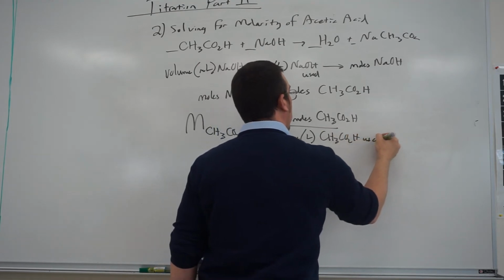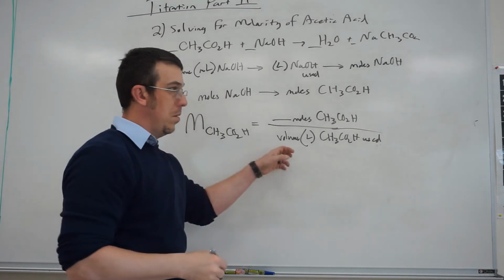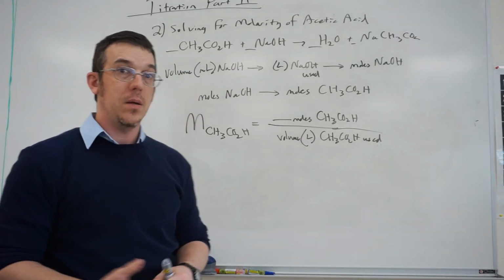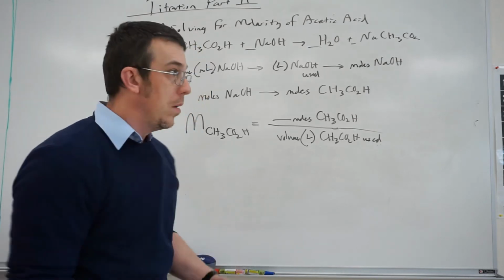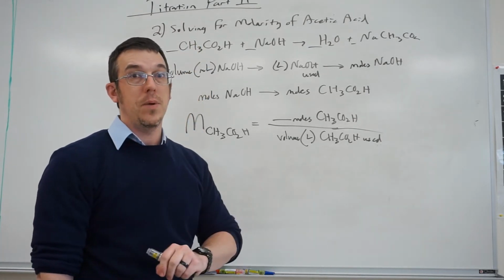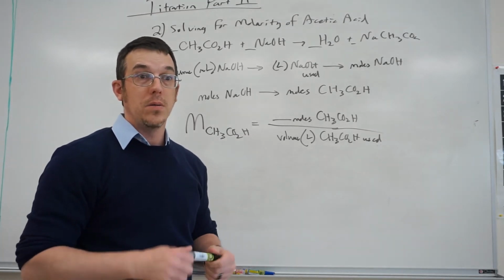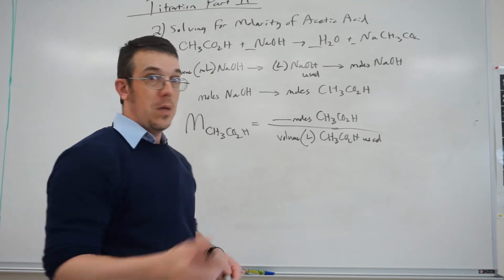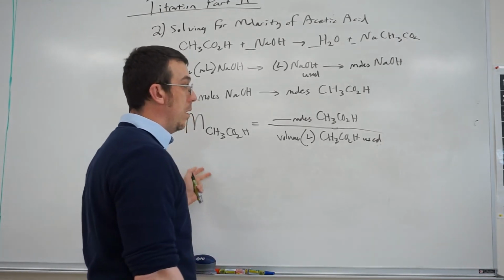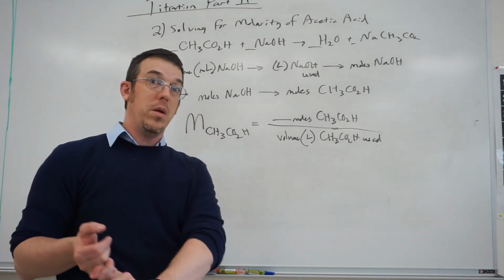used. Again, this will be provided to you on Moodle in a picture. So all your data that you're going to obtain from this is going to be given to you on Moodle in a picture format, and you'll see all this in a Word file as I post it on Moodle. So use that Word file to your advantage as you go through these calculations. So that's part two. Part two is determining the molarity of the acetic acid.